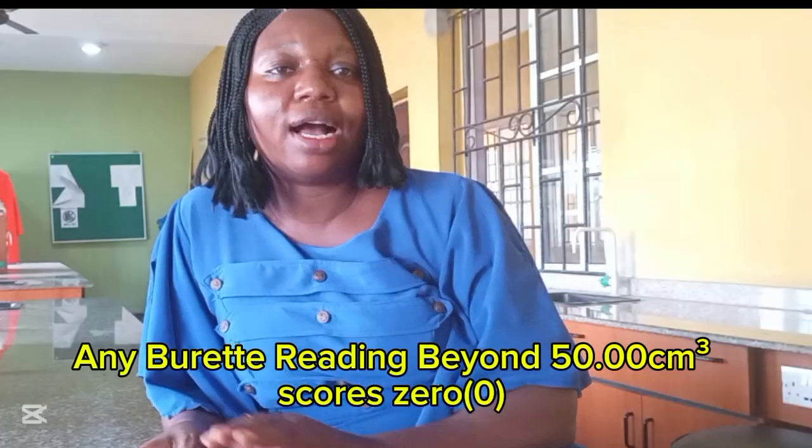The next thing is, if you have a titration value that is above 50, you are getting 0, because WAEC will not give you any titration where the answer will be above 50. That must mean that you have done something wrong and you will score 0 on the table. But whichever value you eventually get will be used for your calculation, but you will not score anything on the table.